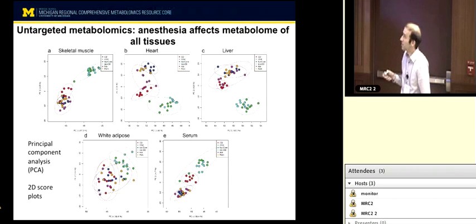Then we add extraction solvent. In this case, we used a mixture of methanol, water, and chloroform. It contained a C13 internal standard mix to enable absolute quantitation of some metabolites. That was our solvent ratio. We did probe sonication for further tissue disruption beyond the cryopulverization, and collected our supernatant from centrifugation. In addition to knowing the wet mass that we started with, we dried the pellet and measured the mass for normalization. We can also do a protein assay on that.